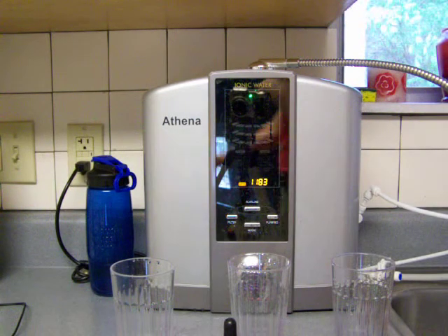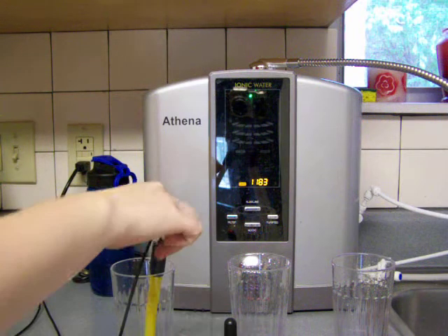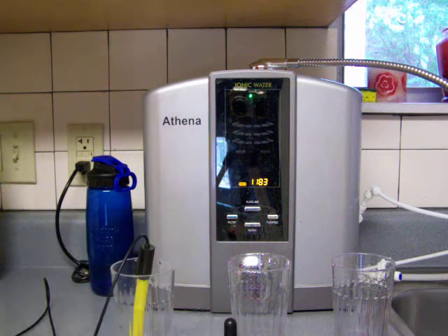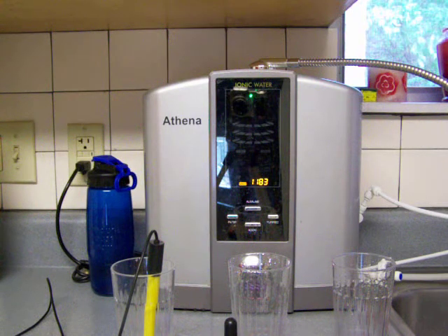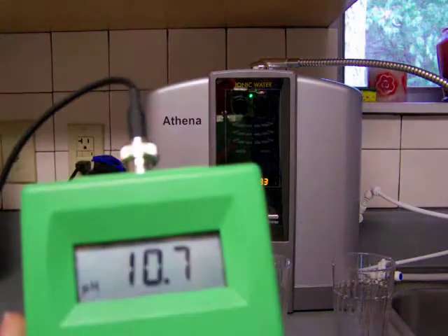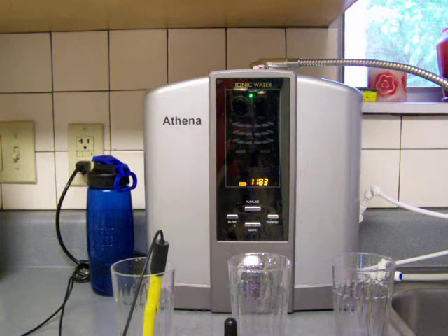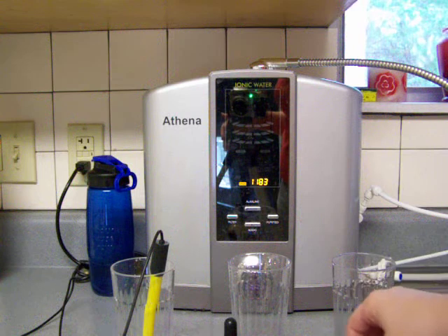Let me grab the peach meter and stick it in here. So it looks like it's a 10.7 pH on our pH meter. That means the smaller bottle was more accurate.